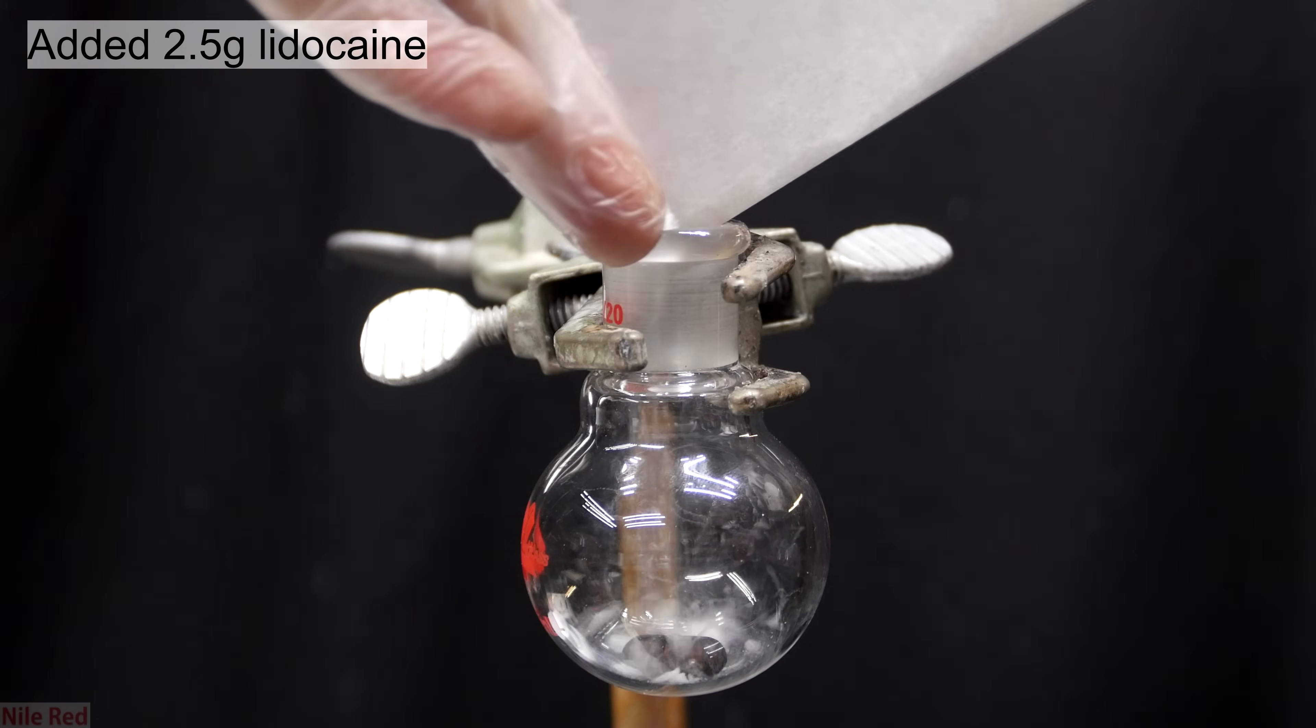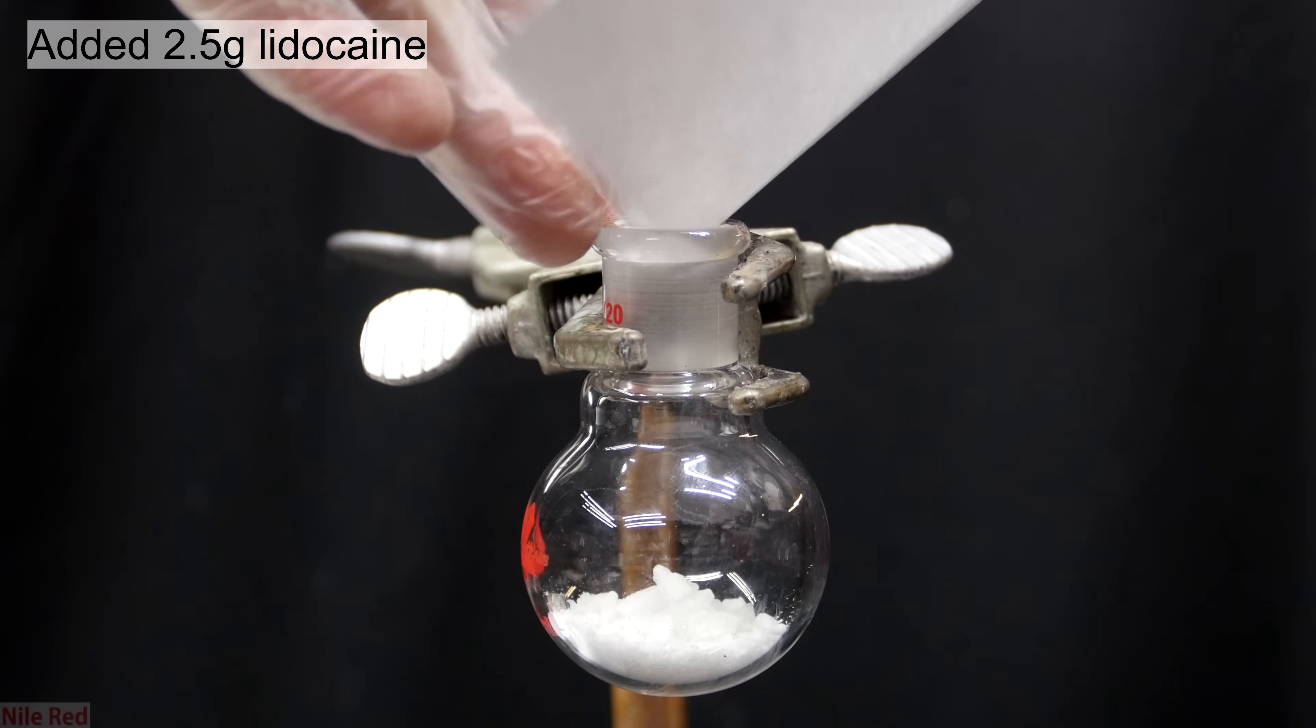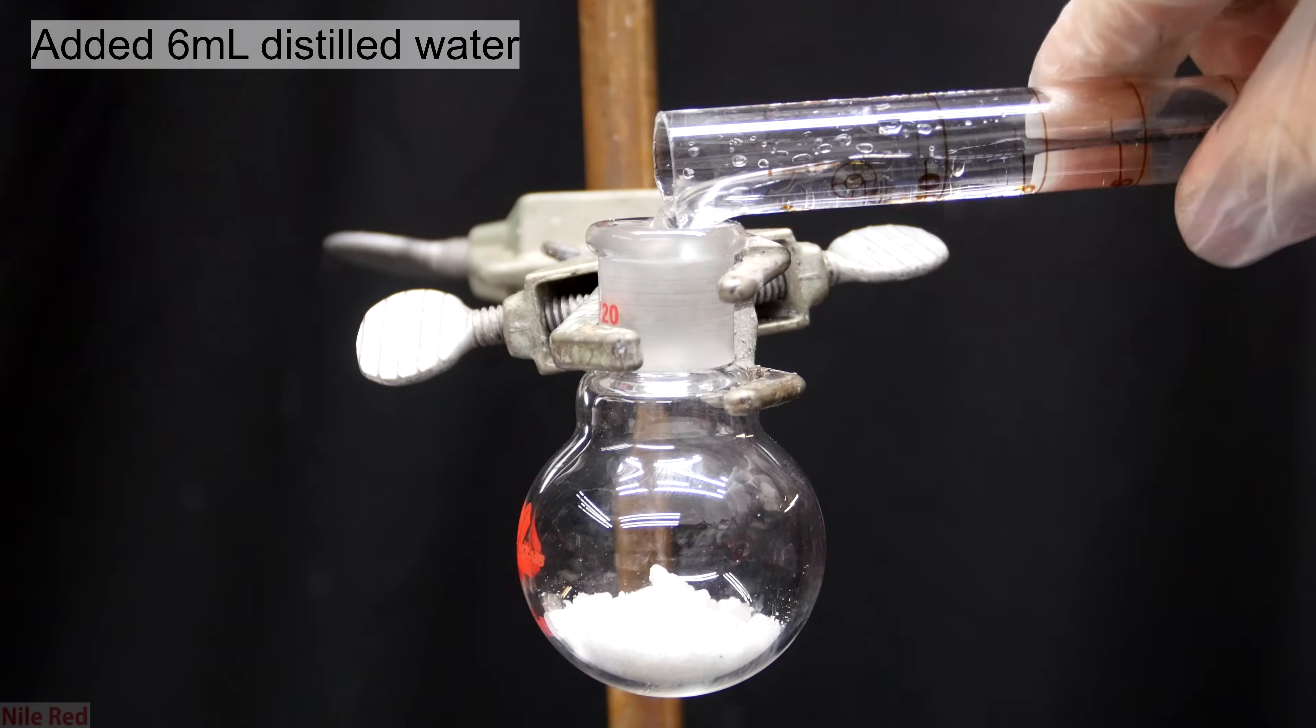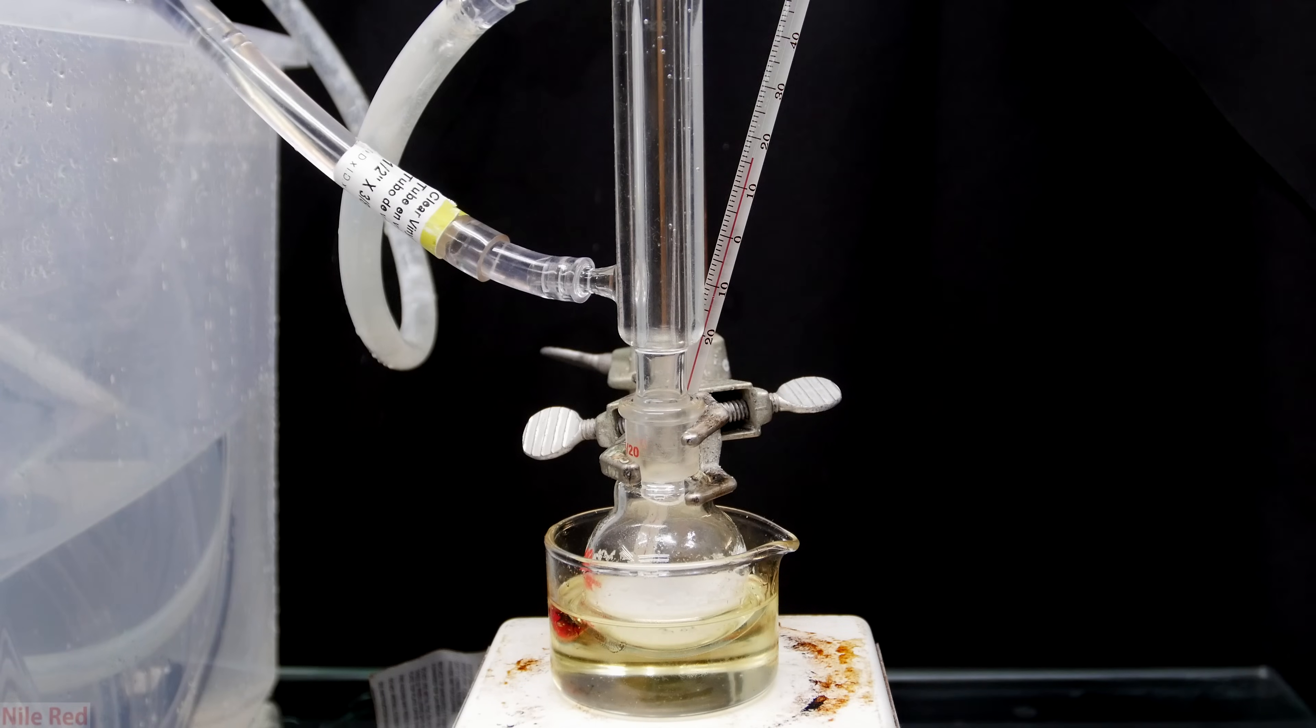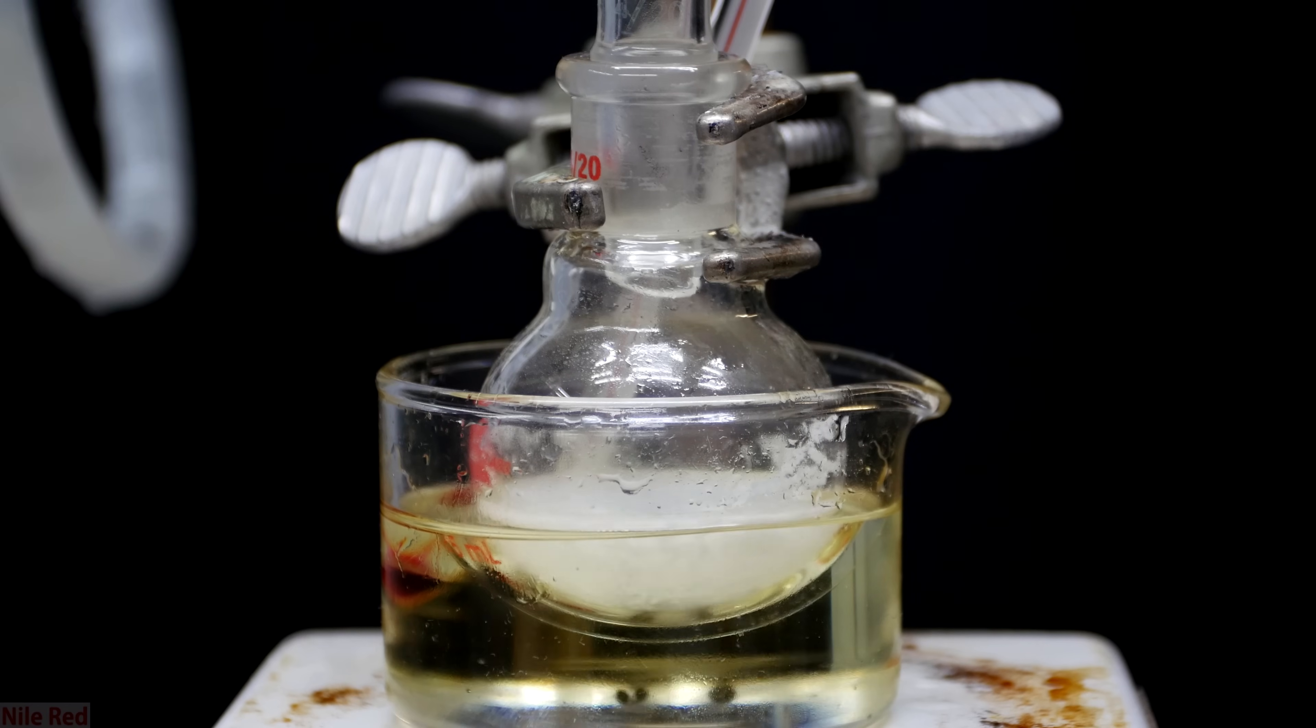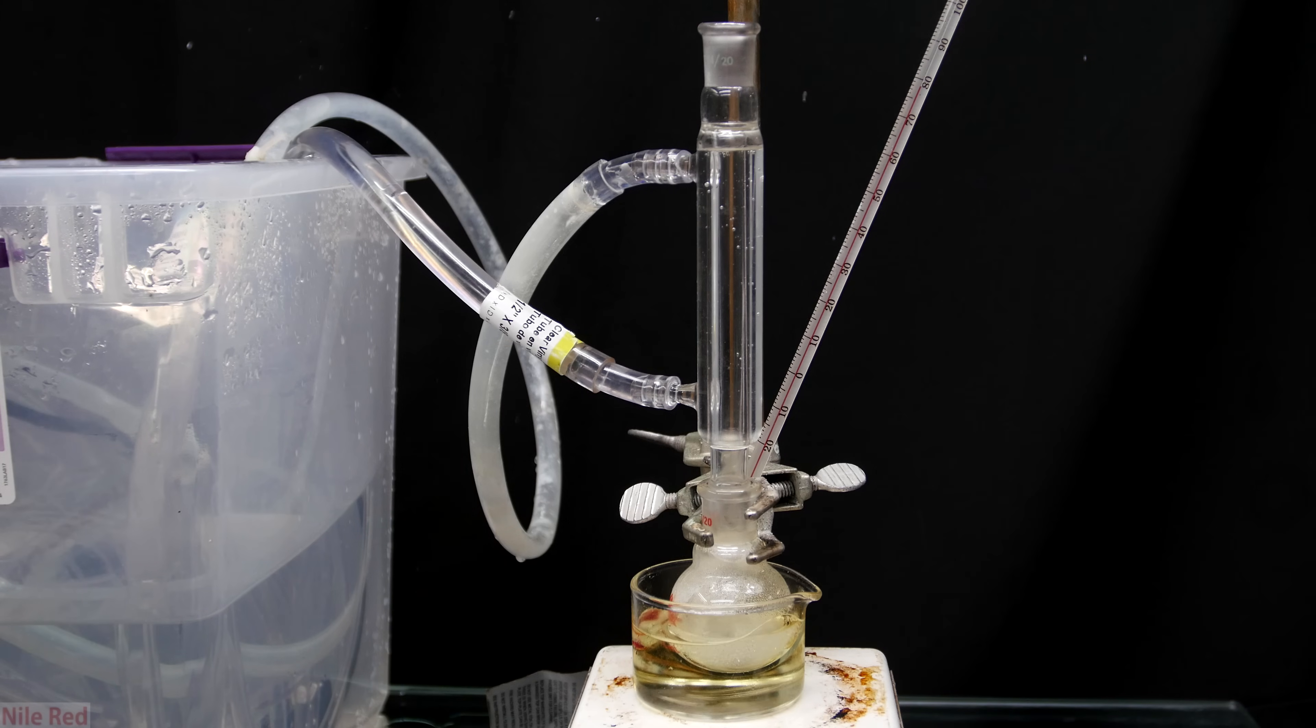To start off, I added 2.5 grams of lidocaine to a 25 milliliter round bottom flask. On top of this I poured in about 6 milliliters of distilled water. I then set up an oil bath with a cold water condenser on top and with a thermometer in the oil. I turn on the hot plate and start the stirring as well. The cold water condenser above should recondense any water that evaporates off. The goal here is to heat the mixture to about 80 degrees celsius.